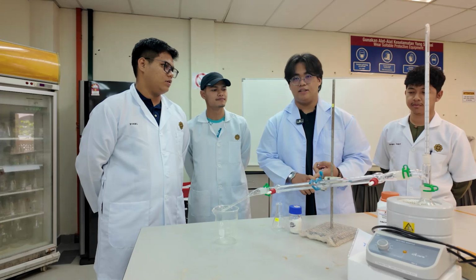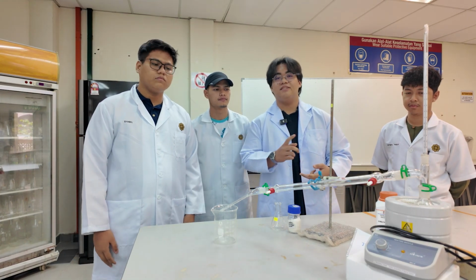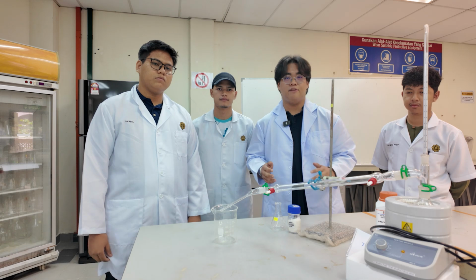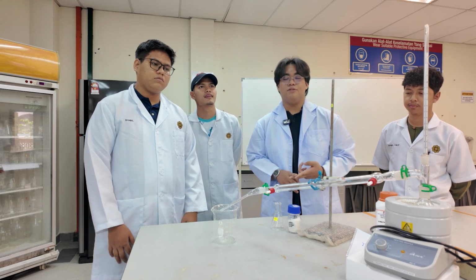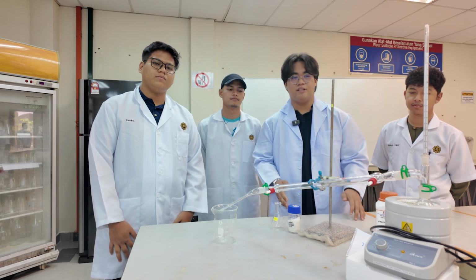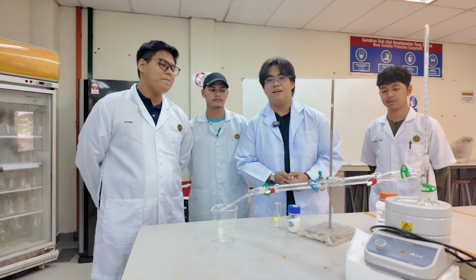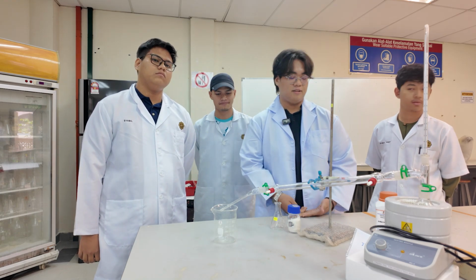Okay. Now, today we have 3 techniques that are included in the experiment. First is extraction, that is separated by solubility, and then next is TLC, that is thin layer chromatography, that we all did in this lab, right? So that is separated using polarity, and right now we're going to talk about distillation. So distillation is separated by boiling point.